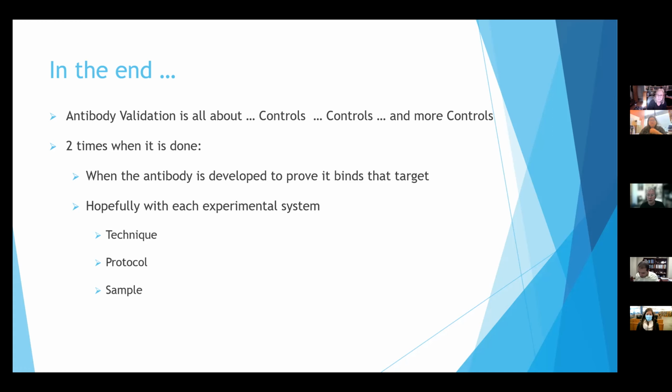Well, I guess they'll know it was a Western blot. And a lot of things are just validated by Western blot or flow cytometry if it's a flow, but they almost will never have the protocol. And the other thing is, since many of them are distributors, they're all selling the same antibody. But you don't know that, unless they're all putting up the same figures. So you need to compare the figures.